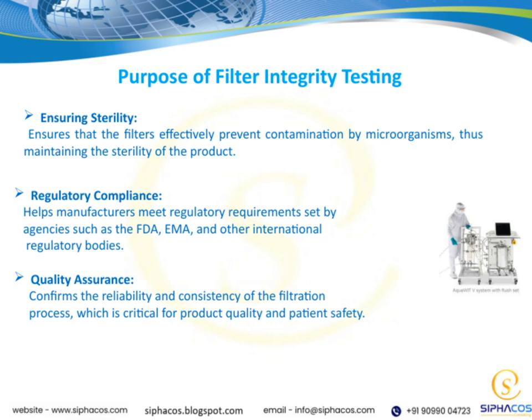And that leads us to quality assurance. By confirming the reliability and consistency of our filtration process through integrity testing, we're safeguarding the quality of our products and, ultimately, the safety of the patients who rely on them. So, in summary, ensuring sterility, adhering to regulatory standards, and maintaining robust quality assurance processes all come together to support the overall goal of delivering safe, effective products.